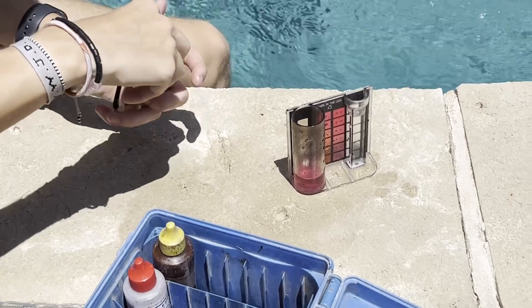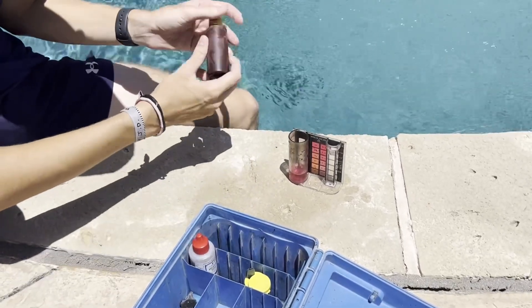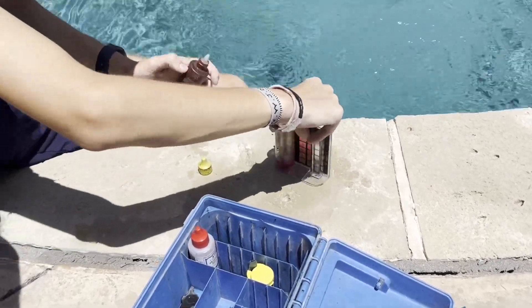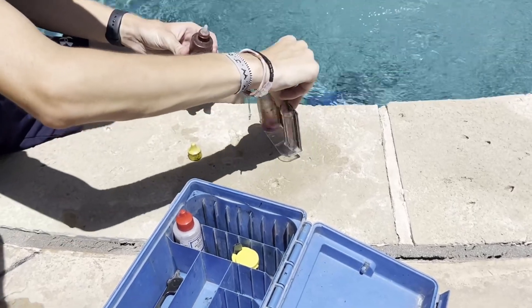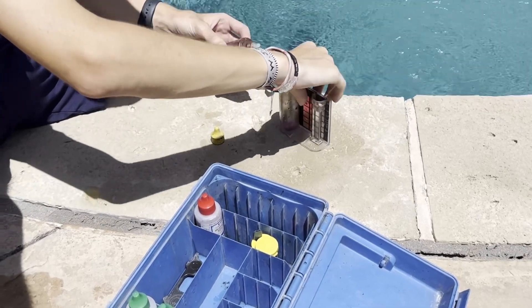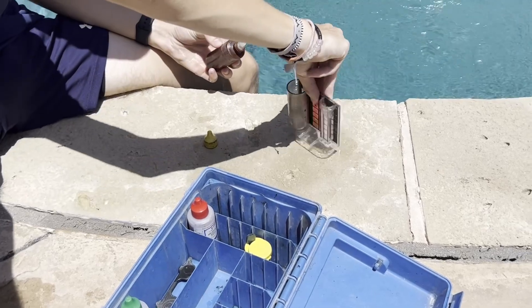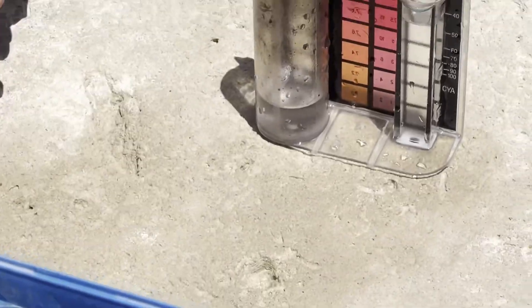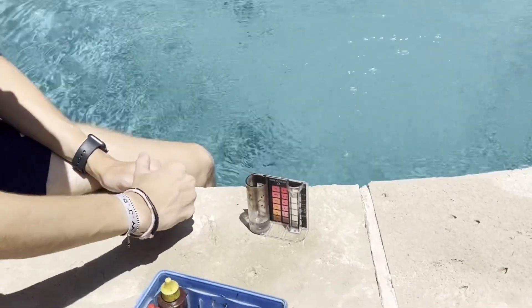Now here's the cool part — we're going to find out how much. Each drop that Jake is about to put in is worth one half of one point. So there's one drop, so that's a half. And what we're looking for is this to turn clear. There's two drops, so we're at one. Three drops, one and a half. We're getting close. Four drops — and now see the sample has turned clear. So we know that the chlorine on this pool is four drops; each drop is a half a point, so that is two.